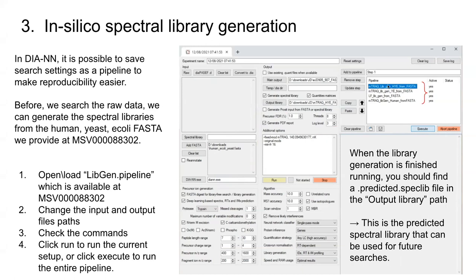Let's say you just generated this one single library by clicking run. After 30 minutes or an hour, you'll have this predicted .speclib file. What this is, is a condensed version of what a TSP might be — it's quite a lot faster to read in, so it's really convenient to use that predicted .speclib.